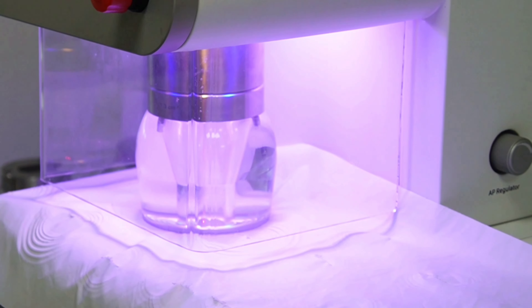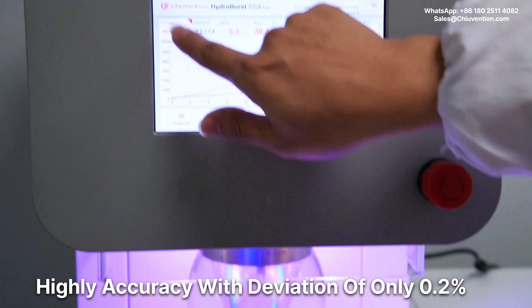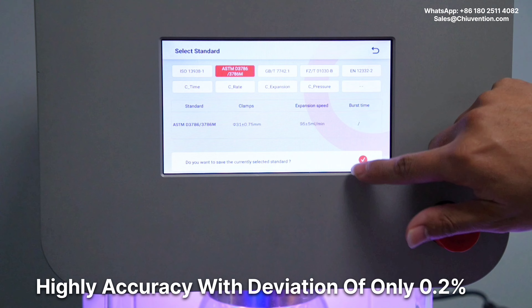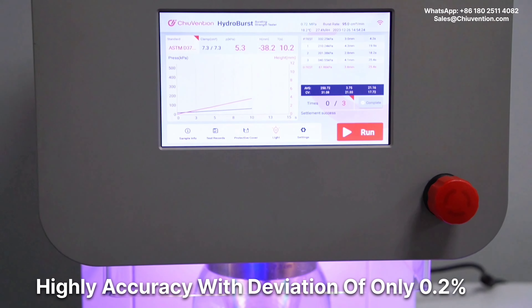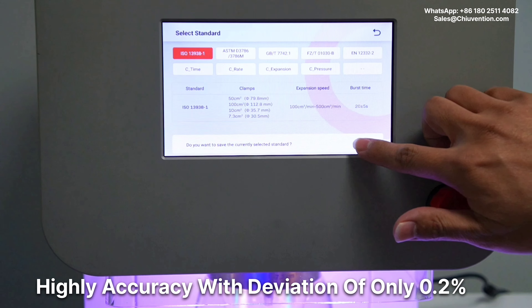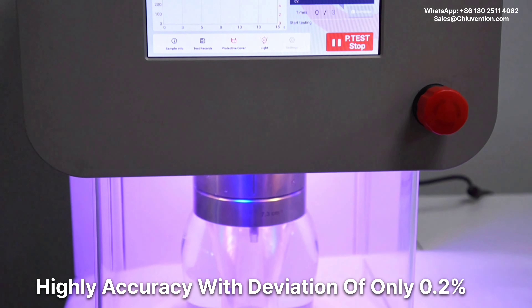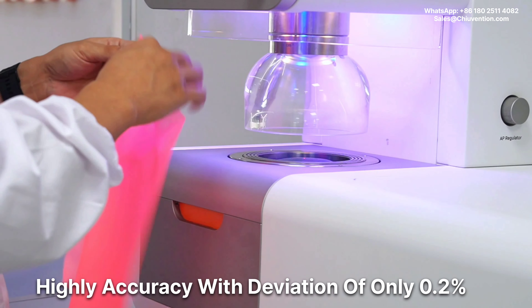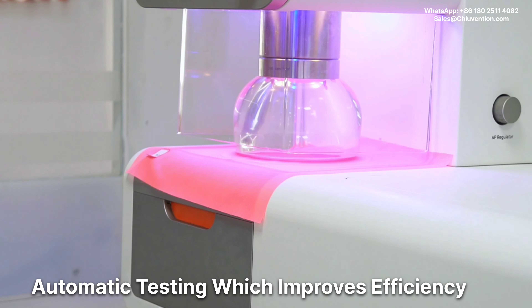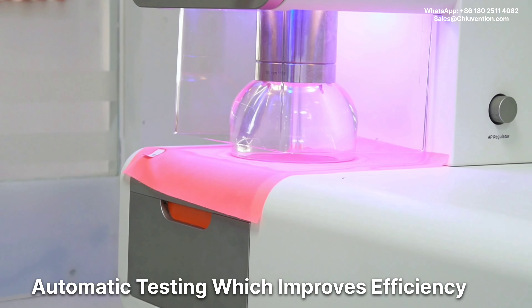The hydro-busting tester is a highly accurate instrument with a deviation of only 0.2%. The pressure measurement part is equipped with a high precision pressure sensor with accuracy up to 0.2%, which means the deviation is 0.2% of the maximum range. This hydro-busting tester is totally automatic, which improves efficiency and reduces operational risk.